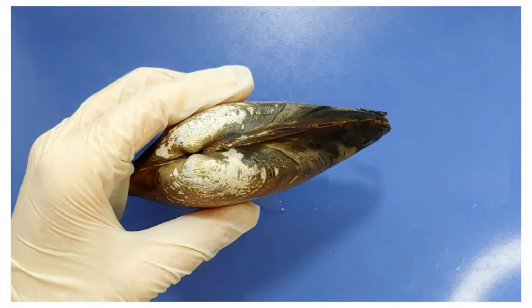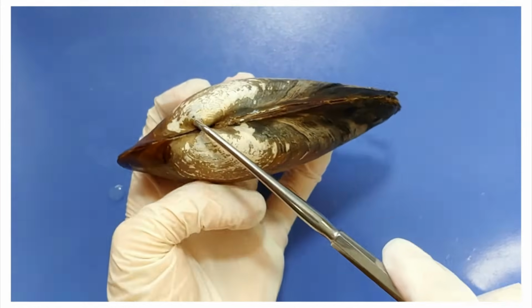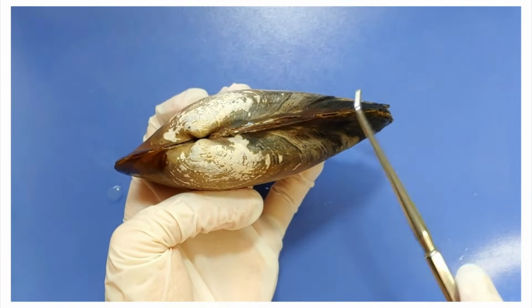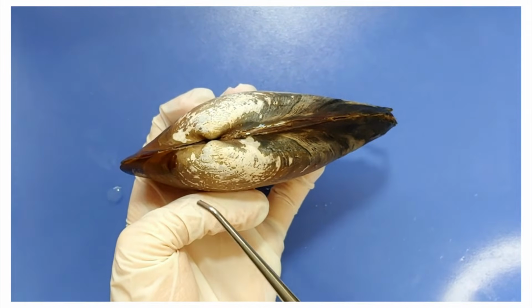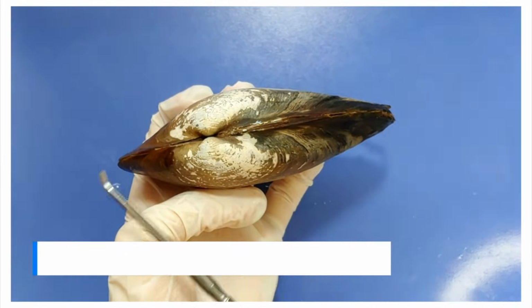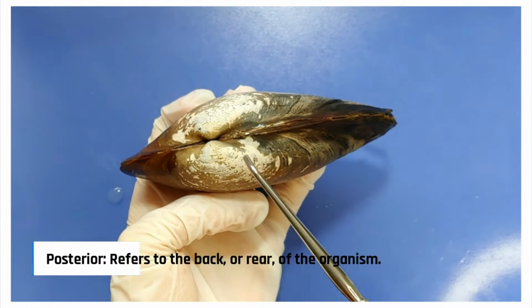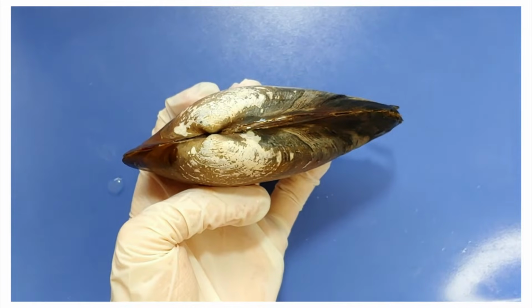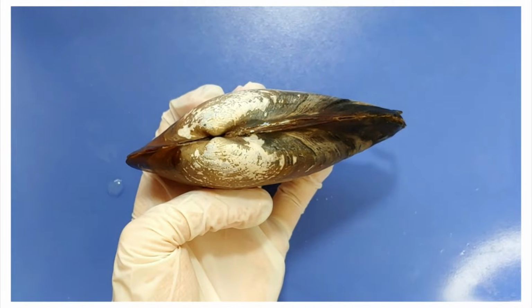By this, I mean that when the clam sticks itself in the sand, the hinge will be the part that pokes out. Now, if you look at the hinge, you'll see that one side is shorter than the other. The shorter side is the front or anterior side, and the longer side is the back or posterior side. This means that when the clam moves, it'll move in the direction of the shorter side.